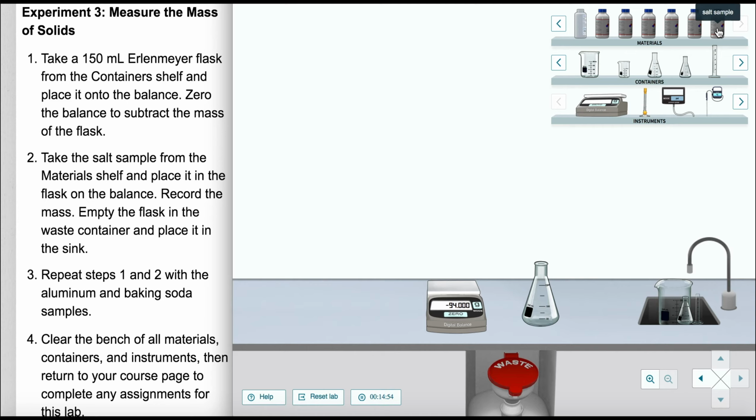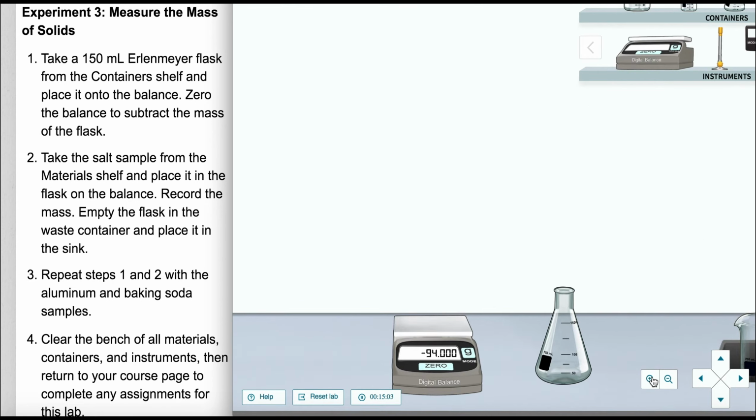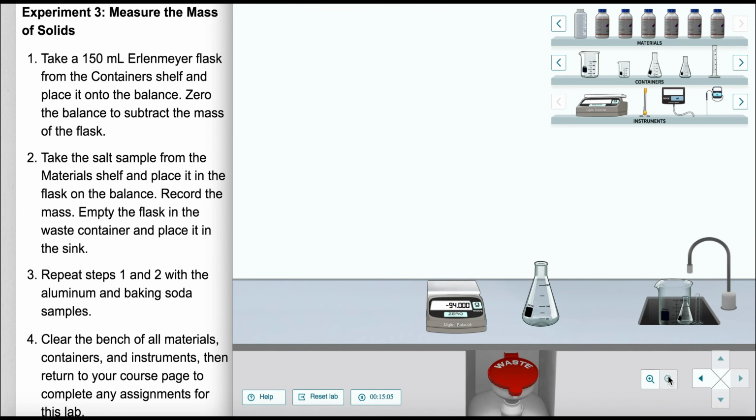It's going to be a certain mass. So we're going to stick it in here. And you'll notice that when I stick it in here, a little amount appears on the bottom. I'll zoom in a bit here. You can actually see it there on the bottom. So even though you might not see anything in there initially, if you look closely you'll see that there is something in there. And if you do try and put some more in, it will tell you that only 1 unit is allowed. So I'll go ahead and do that and you can see this. The container must only have 1 unit, so that means you've already got stuff in there. So it stops you from putting 2 in.